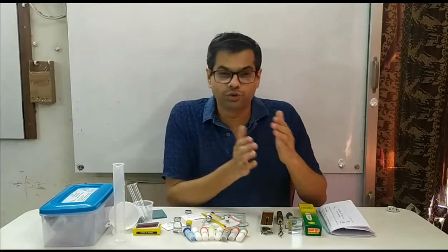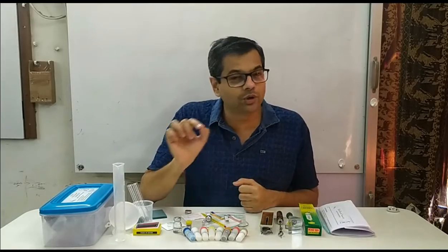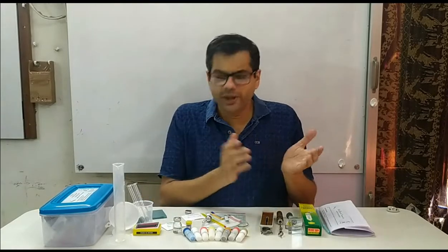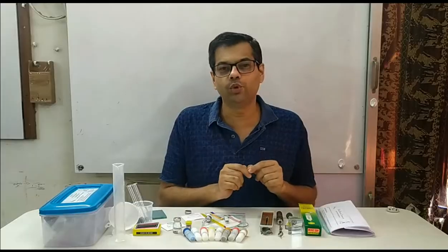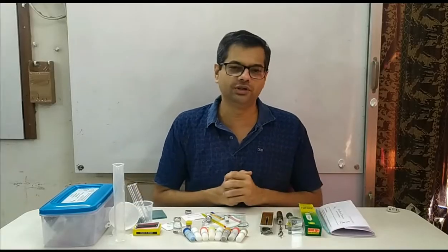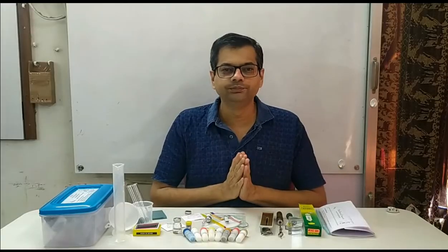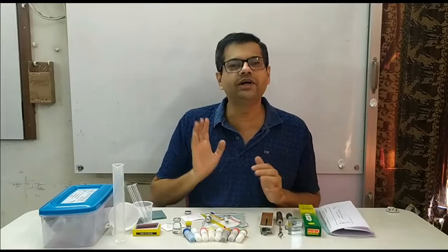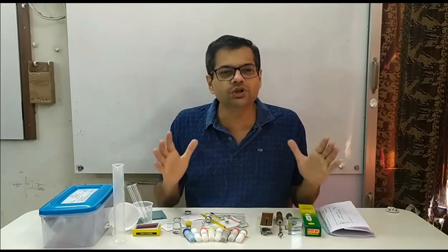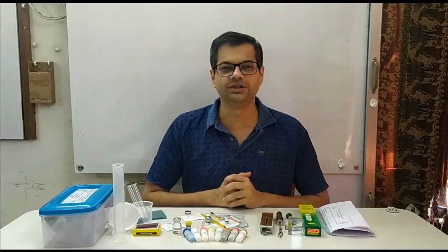First, you would have to do the setup. Then you yourself carry out the experiment and accurately take the readings. Then you would have to note it down in your log book — maintain a good quality log book. Then only you will be able to come to correct conclusions. At the end, you would have to perform the cleanup activity. If you clean the material properly and keep it neatly, then only you are going to find it next time. So all these things also you should learn, and the kit will provide you a good opportunity to learn this.